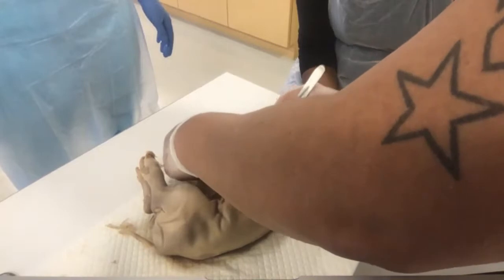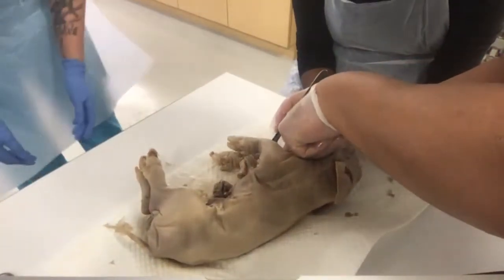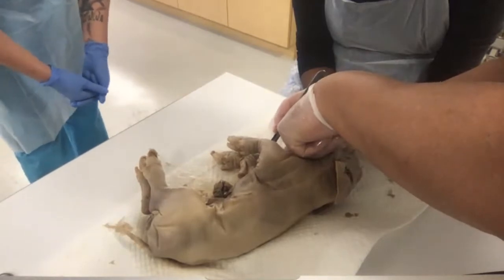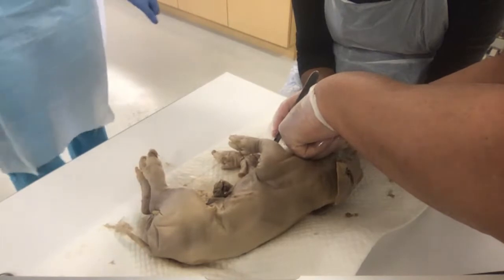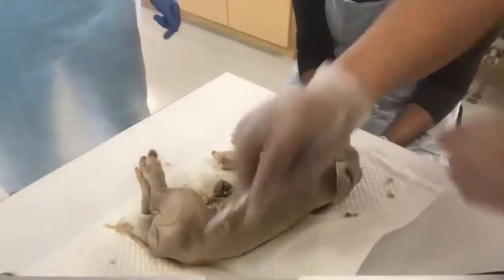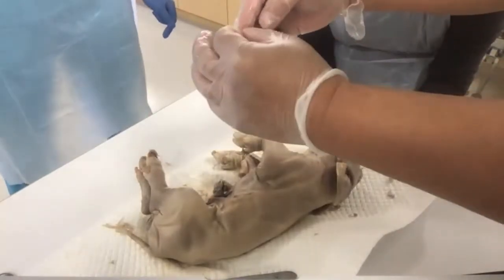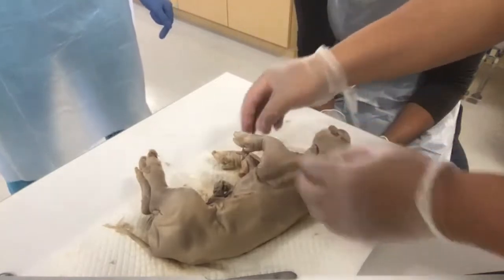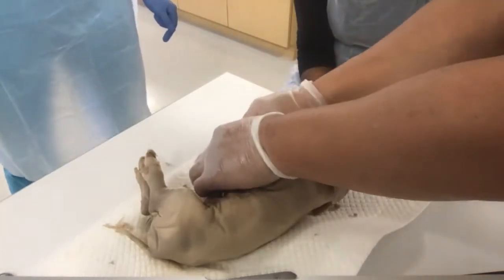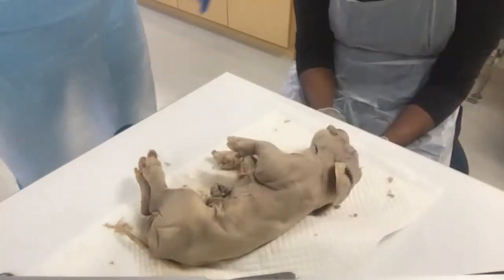Everyone see here how, see all the covering kind of like this part, this thing here? This is a tendon. This is the end part of the covering of the muscle. So it goes like this. There's a covering of the muscle, then it ends up here, right? And this part will then attach to the bone. And you could see the attachment. You could feel it. It's right here. Yeah, and just like chicken, right?